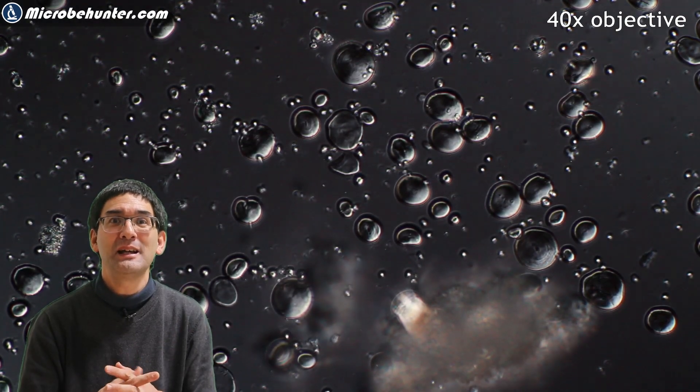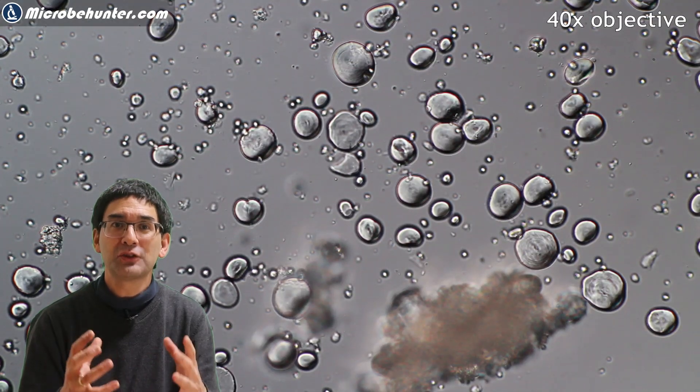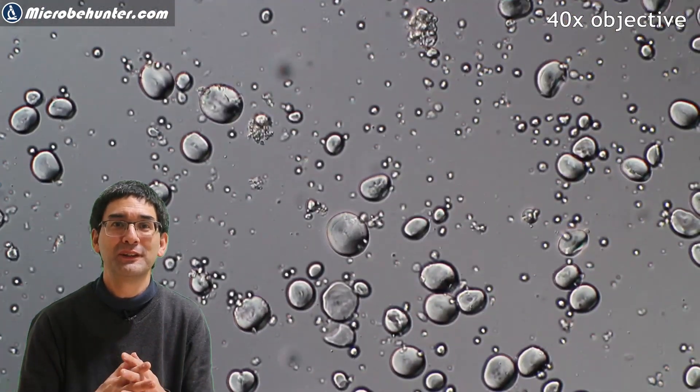One nice thing about starch grains is that they are polarizing, and by rotating the filters you can get a variety of different color effects.